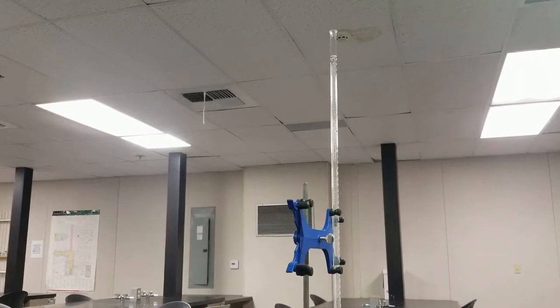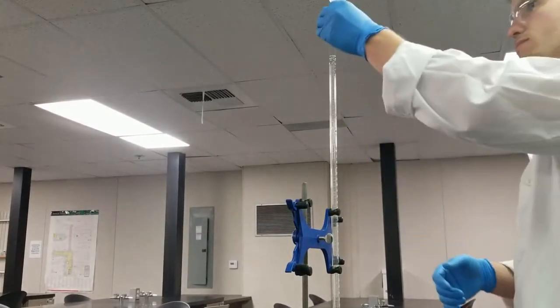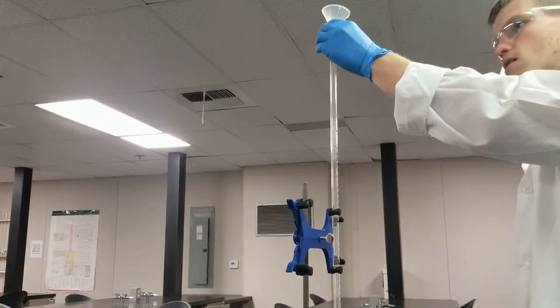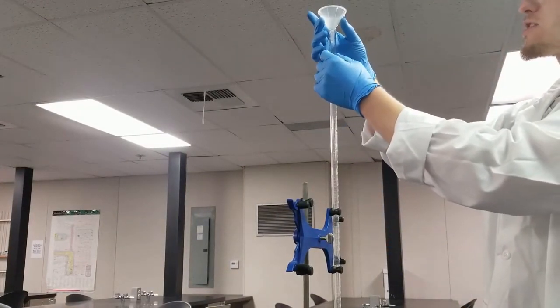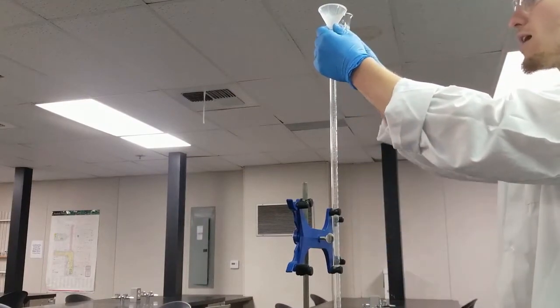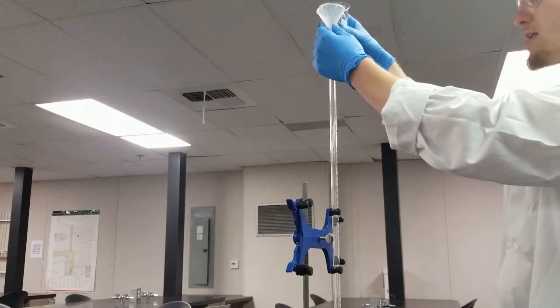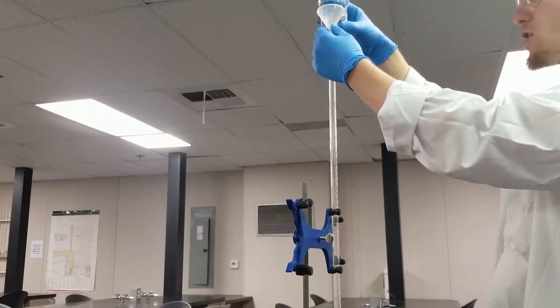All right, next up, we've got to fill our burette with our solution. So I have my burette right here. I'll put the funnel up here and then just lift it up a little bit so there's a little gap here so the air can escape and stuff doesn't flow over. And I'm just going to slowly add about 50 ml of our silver acetate. We don't want to go above the 0 line of the burette.